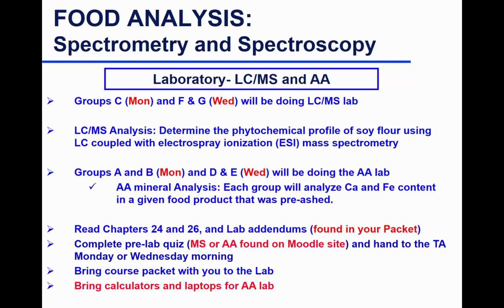And that same product you'll be doing all proximate analysis on. So by the end of 3-4 weeks, you have analyzed everything in that product, whether it's fat, moisture, ash, protein, carbohydrate by difference, and minerals. On that one product, you'll be very intimate with that product by the end of 4 weeks.